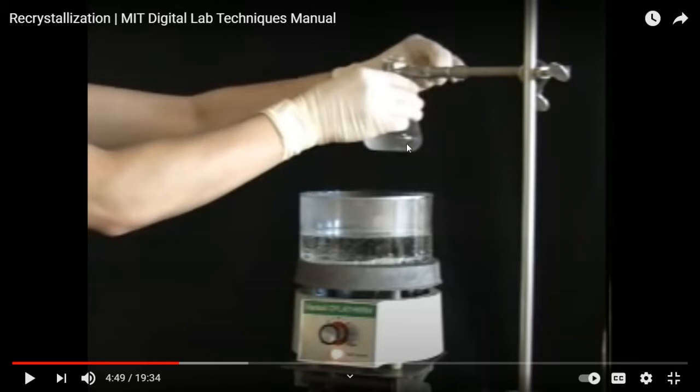Erlenmeyer is one of the alchemists. He was not a real chemist, but he made up this equipment. Okay, so we still give the name, the alchemist Erlenmeyer, for this equipment.